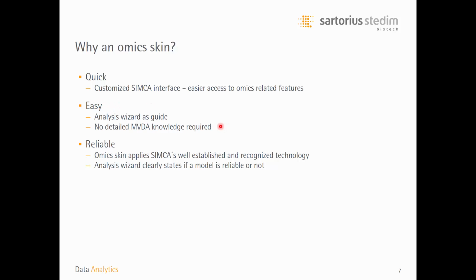And when developing this analysis wizard, we have also done that with the vision that the user should not necessarily have to know a lot about multivariate data analysis. So no detailed MVDA knowledge is required before you can start to use the analysis wizard and the Omics Skin.